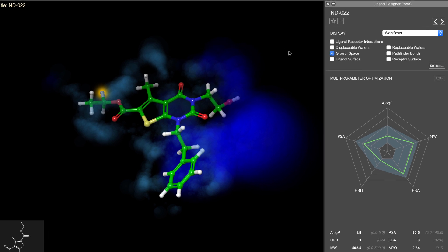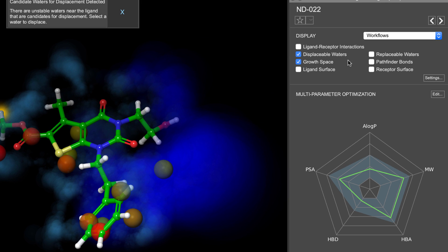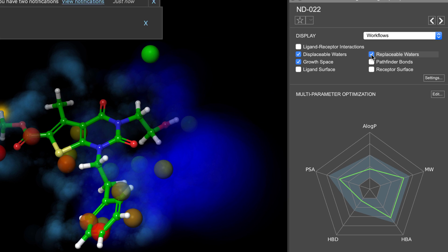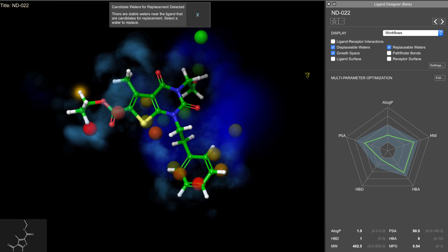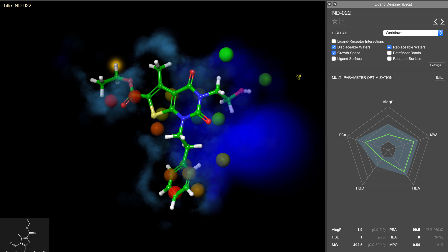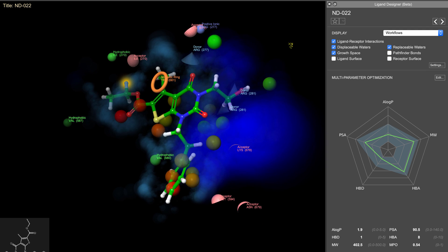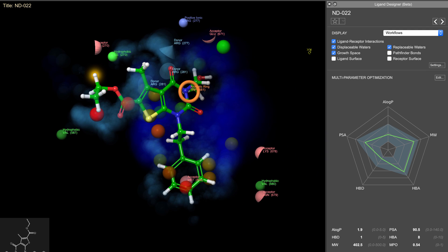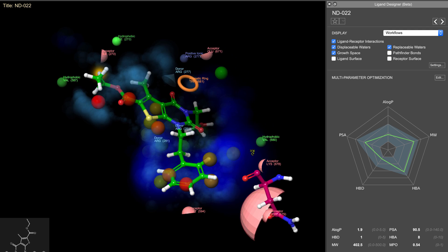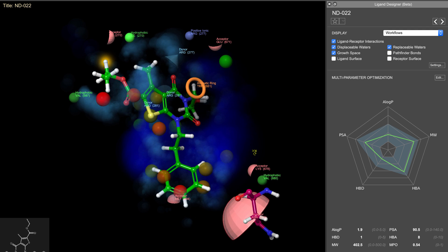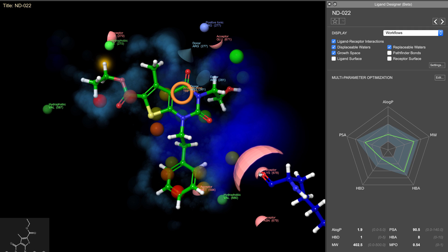Here we can overlay the water map data, if available, such as the location of unstable waters, which can then be targeted for displacement. And using pharmacophoric representations, we can visualize donors, acceptors, aromatic rings and hydrophobic groups. These can then help highlight unsatisfied sites with the potential to form ligand receptor interactions.